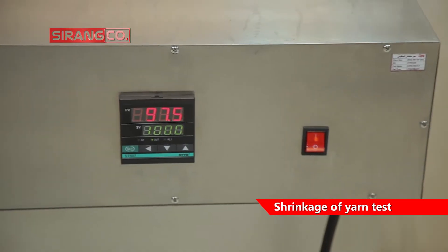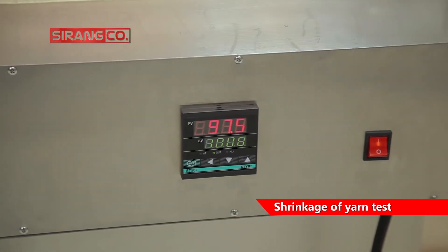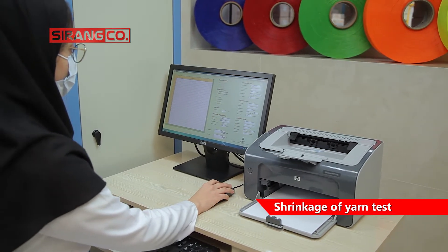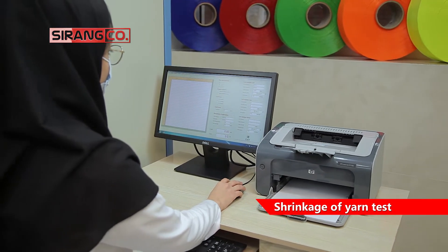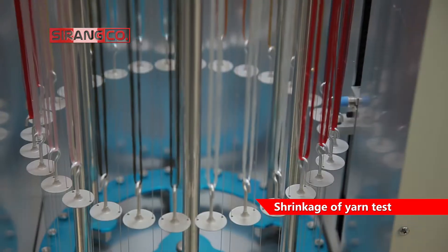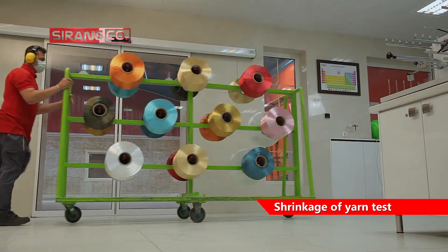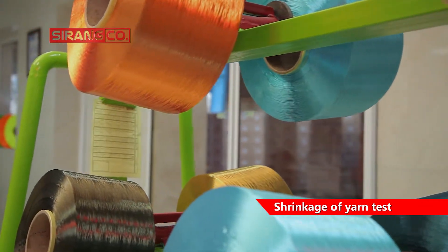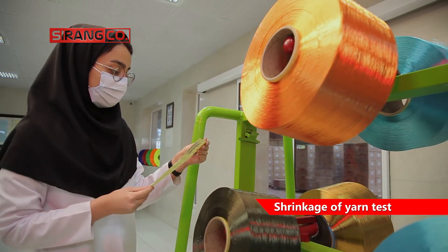Yarn length before and after the process is measured under certain stress and is expressed as a percentage of the initial yarn length. The results of the measurement of this characteristic can be used to predict the dimensional stability of the fabric after washing and heating processes at high temperatures.